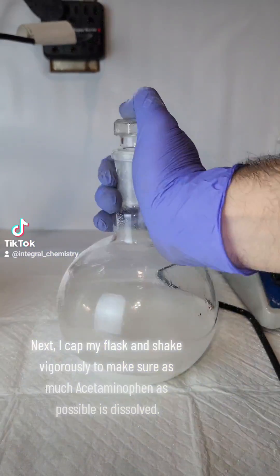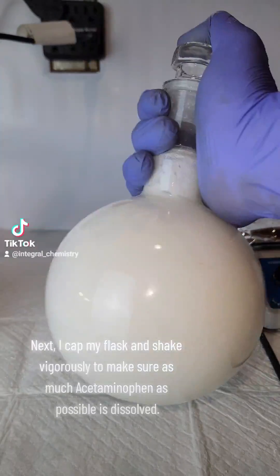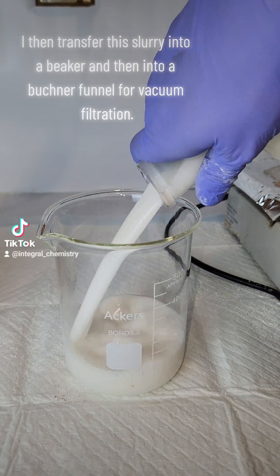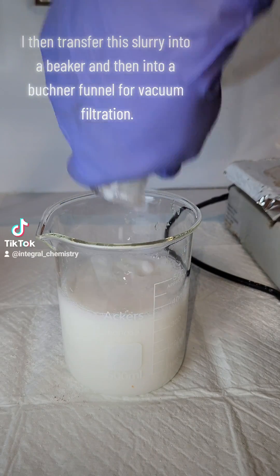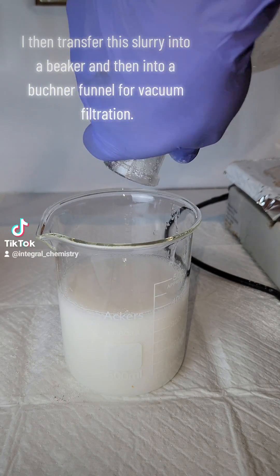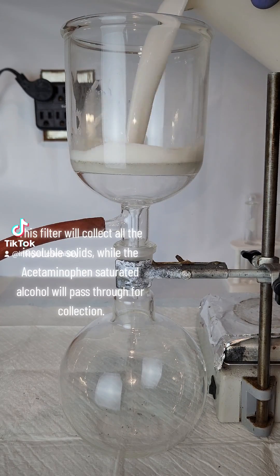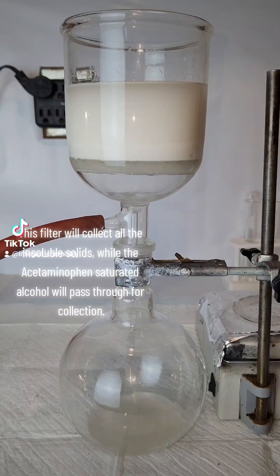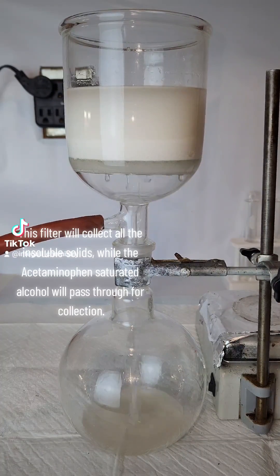Next, I cap my flask and shake vigorously to make sure as much acetaminophen as possible is dissolved. I then transfer this slurry into a beaker and then into a Buchner funnel for vacuum filtration. This filter will collect all the insoluble solids while the acetaminophen-saturated alcohol will pass through for collection.